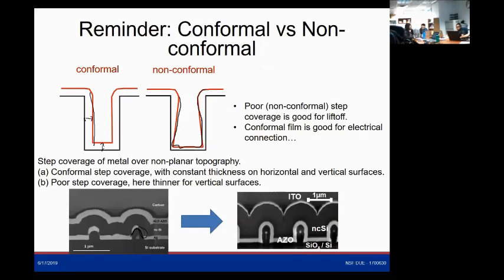Now, at that point, the student that I was working with switched to ALD. My boss told him to switch to ALD. And look at the response. It nicely coated very well over that step. So ALD will give you super nice control and you will just admire it.